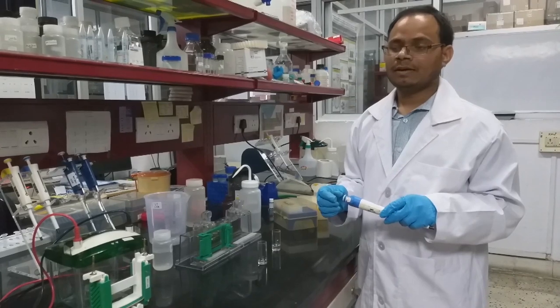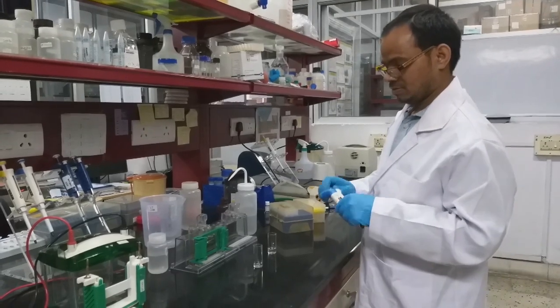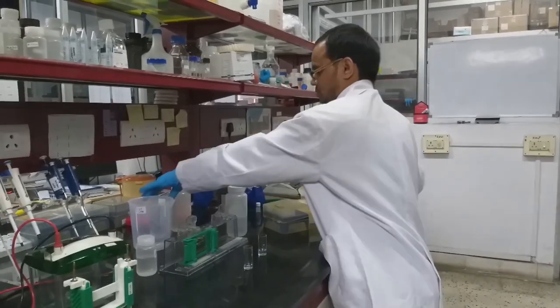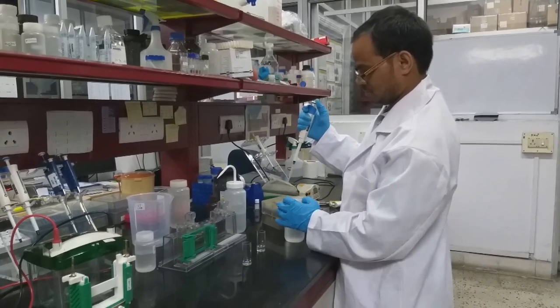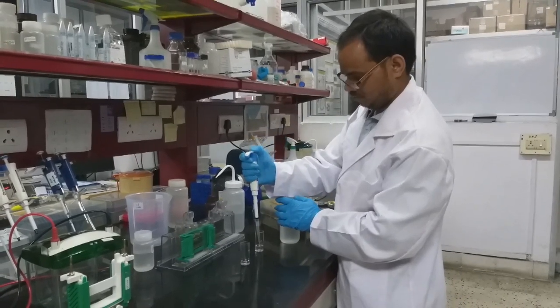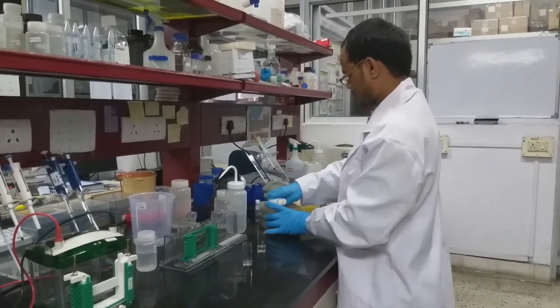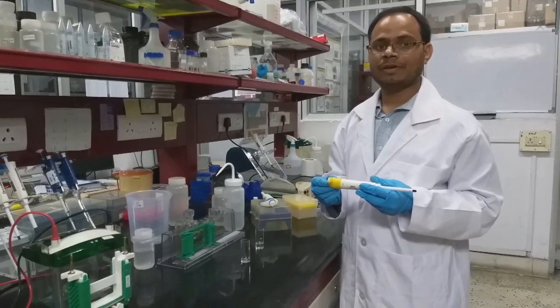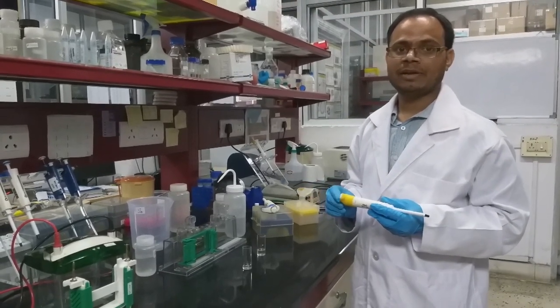Microliter of Tris HCl pH 6.8. Microliter of APS and 50 microliter of SDS we have to add. At the end we have to add 5 microliter of TEMED.